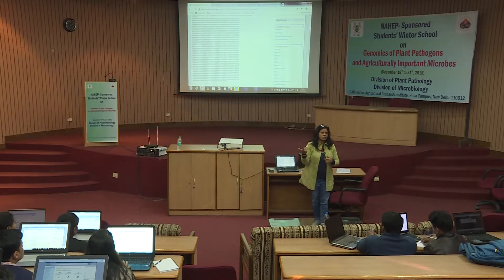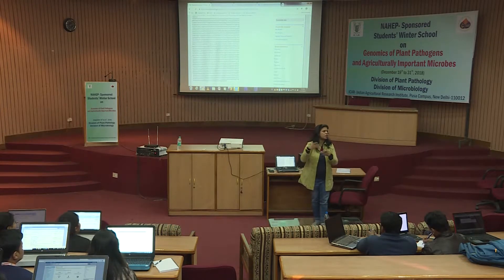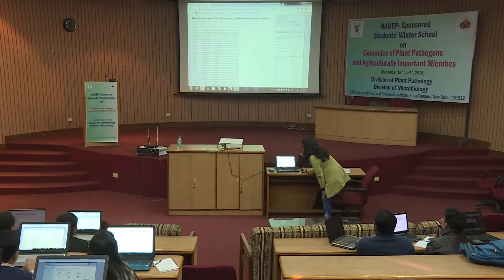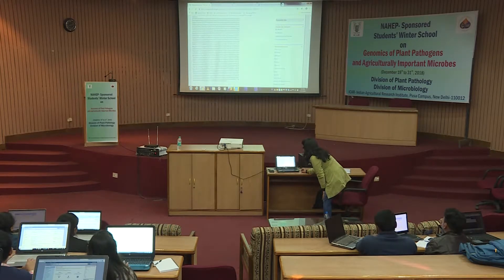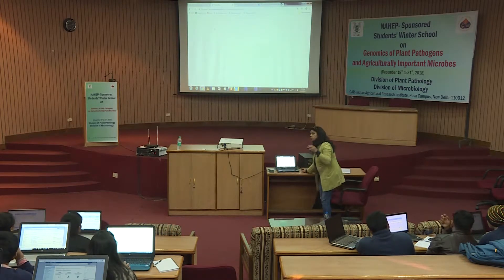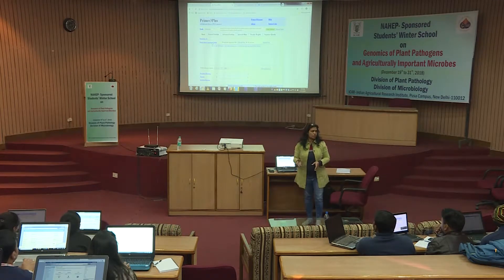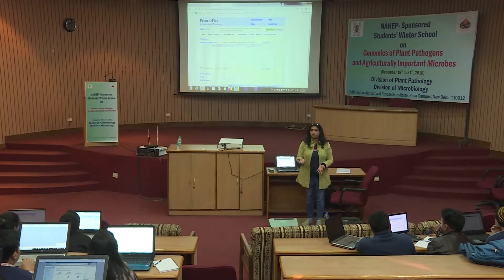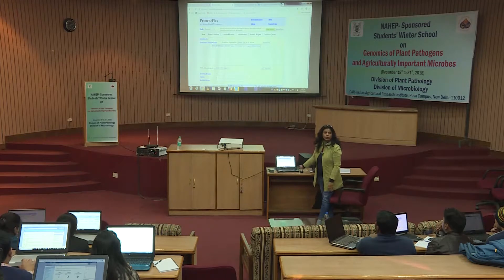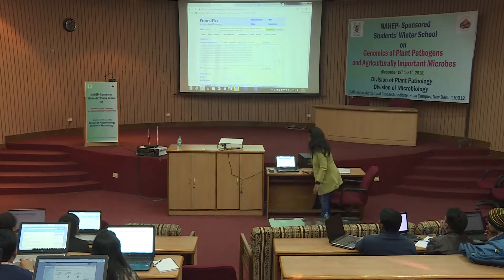Once you've identified the conserved region, pick any reference sequence from that set — it is representative of all the entries you downloaded. Then take that sequence and go to Primer3Plus, which is an online software. You can do it manually also, but these days there are several softwares that can generate the primers for you and they work very well.